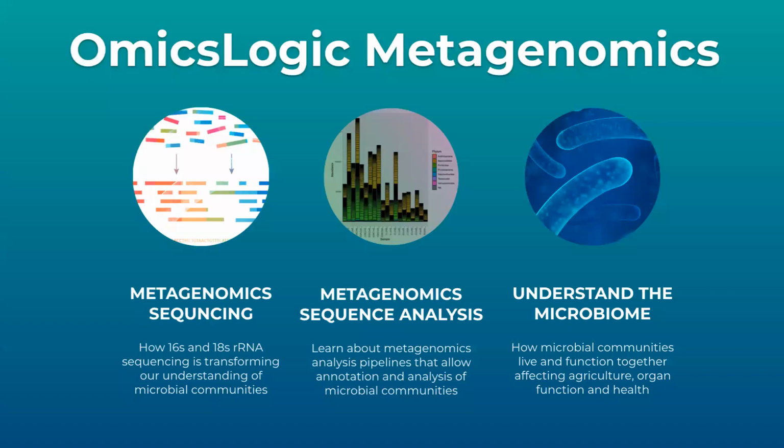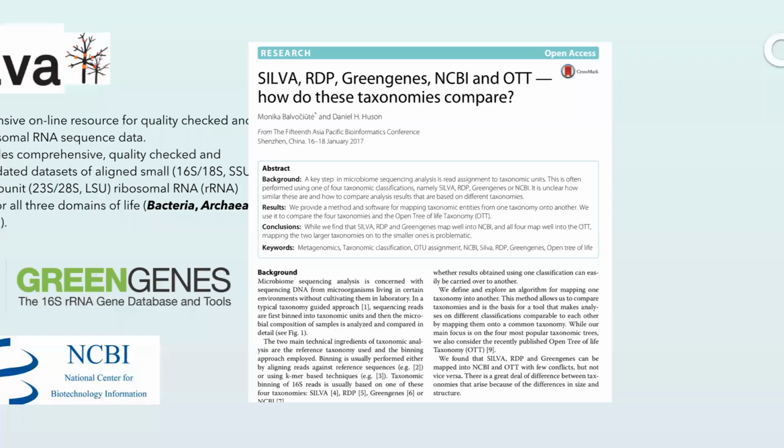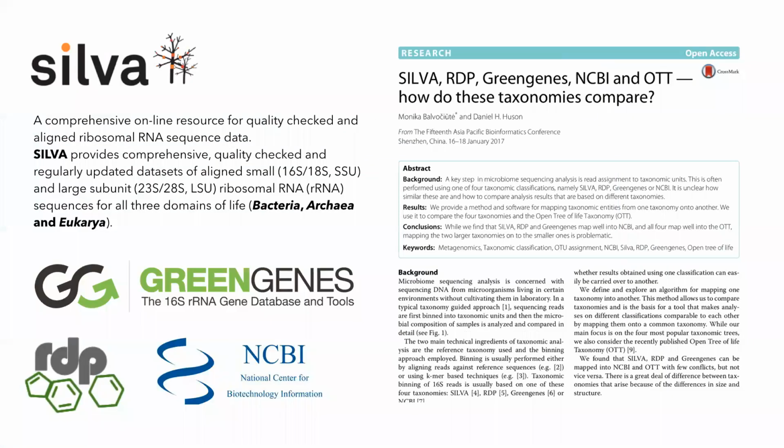this pipeline. In our last session, we talked about mapping on databases. Whenever we have any kind of sequencing, either the full 16S ribosomal RNA gene, or when we look at the hypervariable regions, like what we'll do today, in either case, we rely on these databases.